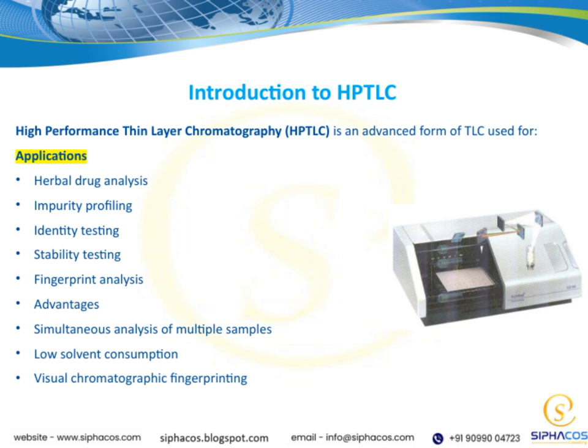It's also used for impurity profiling, which is essential for quality control and safety. Additionally, HPTLC plays a key role in identity testing, stability testing of pharmaceuticals, and fingerprint analysis, where we obtain a visual profile of complex mixtures.